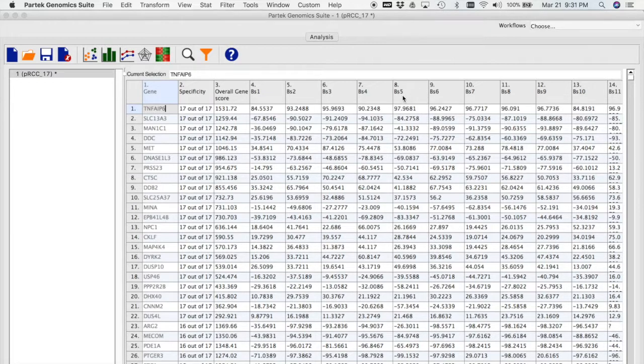I'm also going to say that as a data scientist, this is most of what I do, just getting the data to a point where I can actually look at it. So this is a pretty common task for any data scientist.